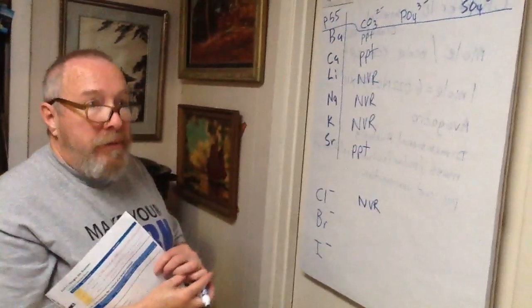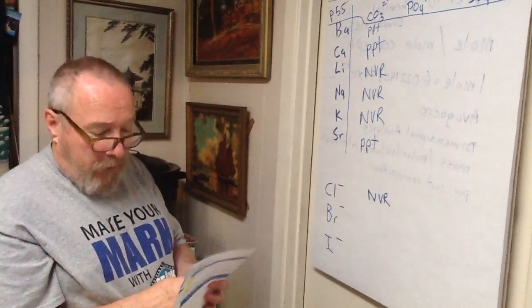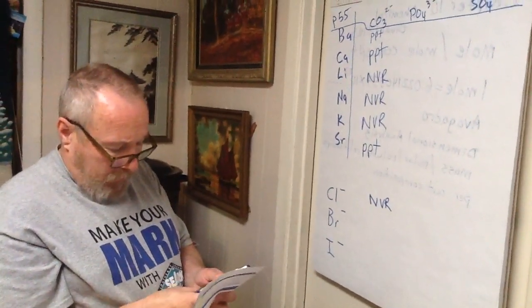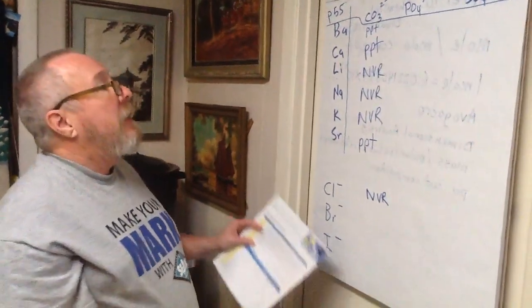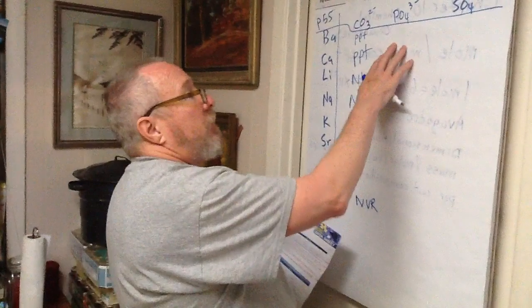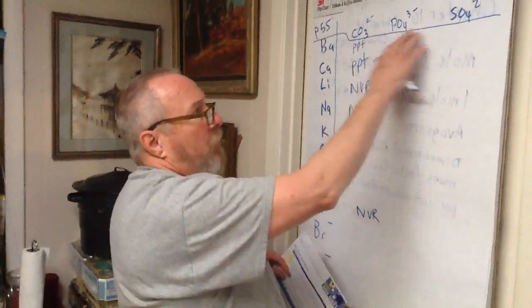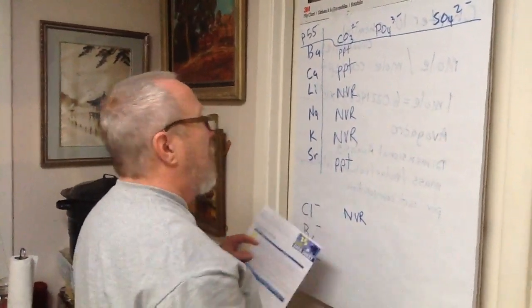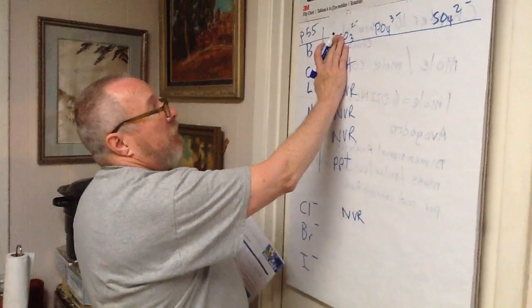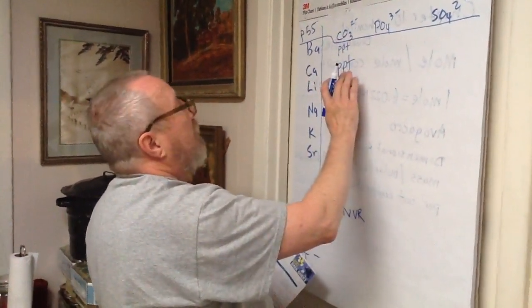Okay? And then we reacted them with ammonium hydrogen phosphate. And these are all great substances, as we'll see later when we start studying aqueous reactions and solubility. They use the ammonium salts because ammonium salts are always soluble. But, like I say, I substituted sodium carbonate because I didn't have the ammonium carbonate.